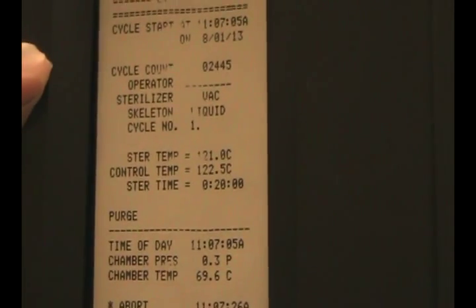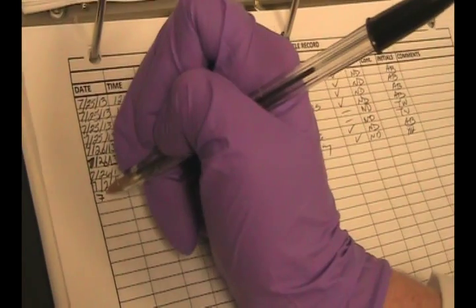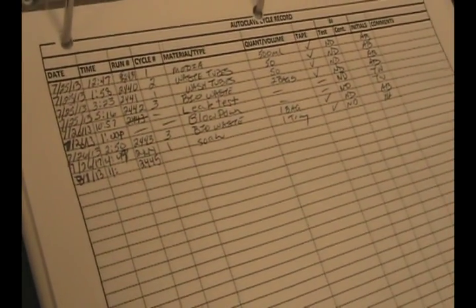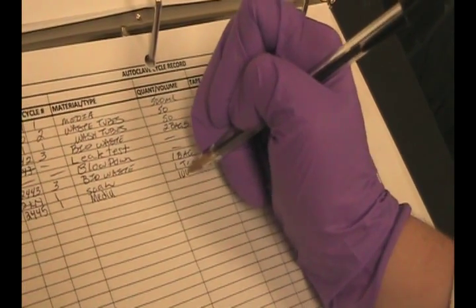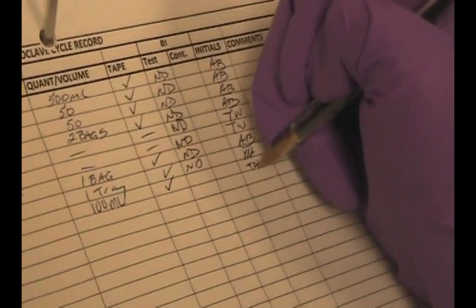Be sure to log all the information in your logbook. This cycle count number is 02445. In your logbook, write in your run number, the date, what time you ran the cycle — which will also be indicated on the tape — the cycle number that you ran, what exactly it is that you autoclaved (in our case it was media), how much media (100 mls per vial or per flask), whether you did the test, and your initials.